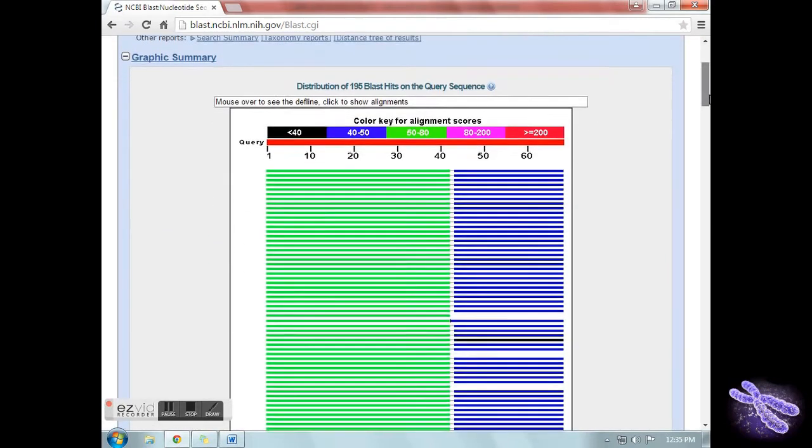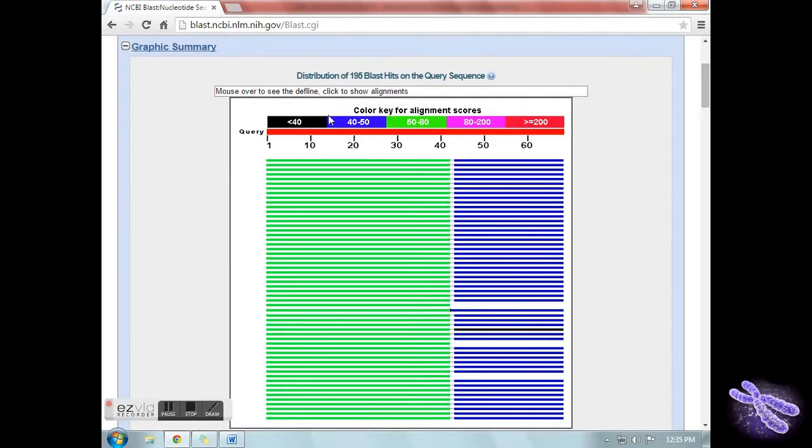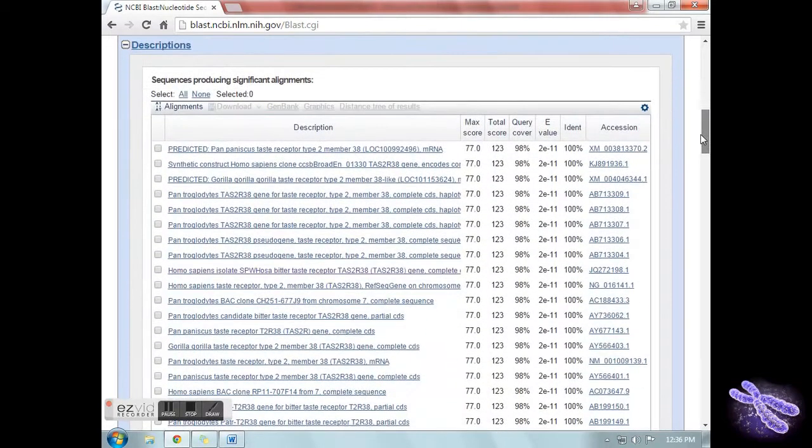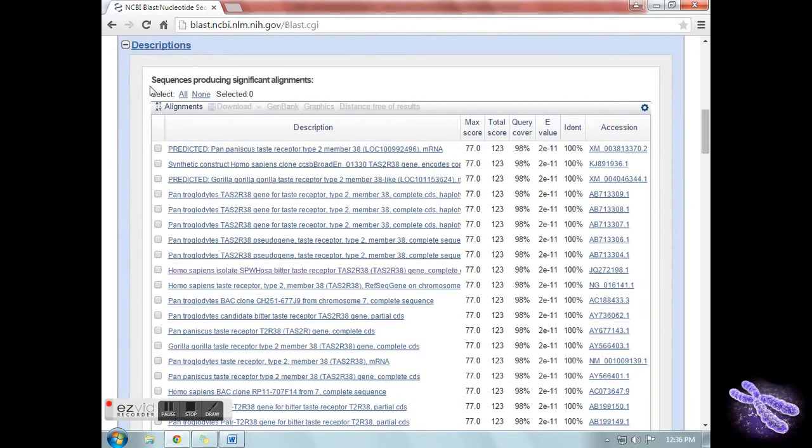The results are displayed in three ways. The first is a graphical overview, showing how other sequences match with your original sequence.